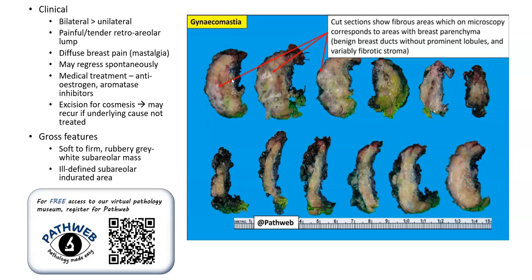Grossly, there is usually a soft to sometimes firm nodule or mass, and this lesion is usually subareolar in location. Sometimes it is rather ill-defined. Here is an example of serial sections taken from a more fresh case, and we can see that there are areas of whitish or collagenous stroma, mixed with yellowish fatty areas.